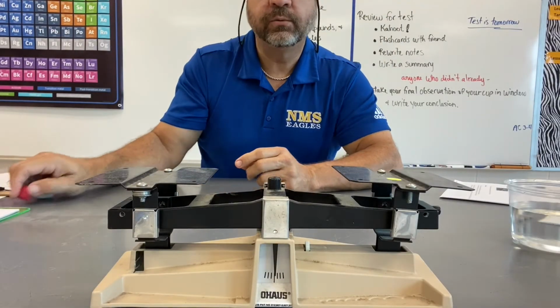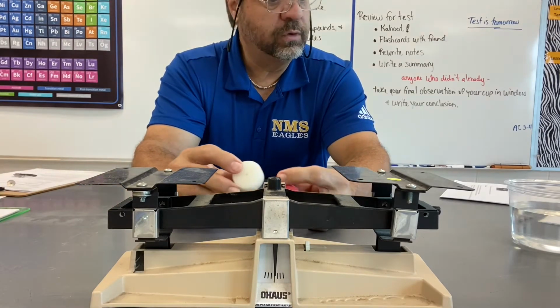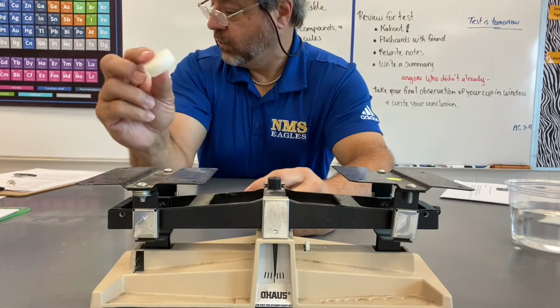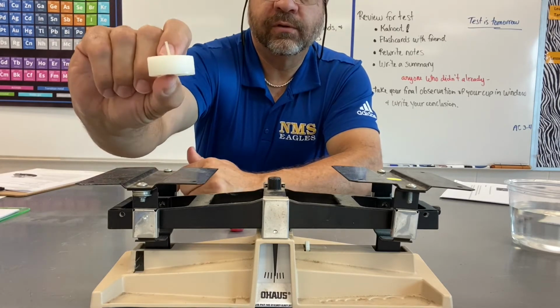Guys, we are continuing our examination of density here. And so we're looking at two objects. First, I have a tea light candle. The wick has just dropped out of it. Let's see. Just so you can see what it is here. There's a candle.